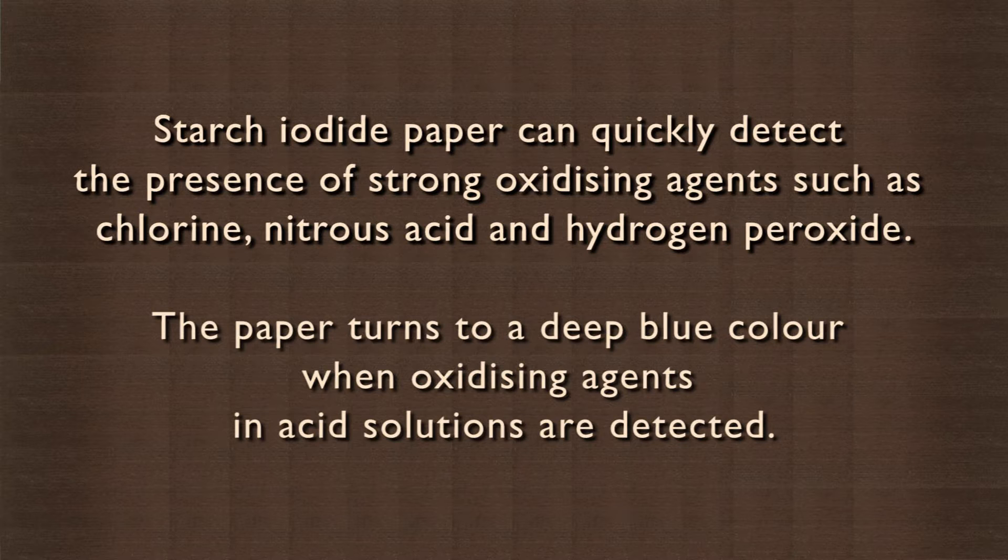The paper turns to a deep blue color when oxidizing agents in acid solutions are detected. Today we will make our own starch iodide paper and test it.